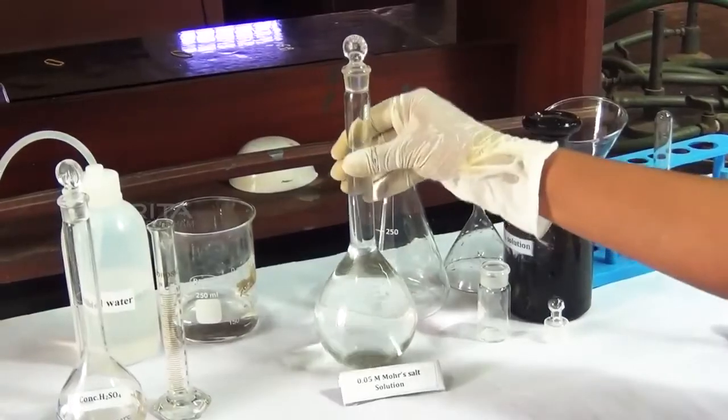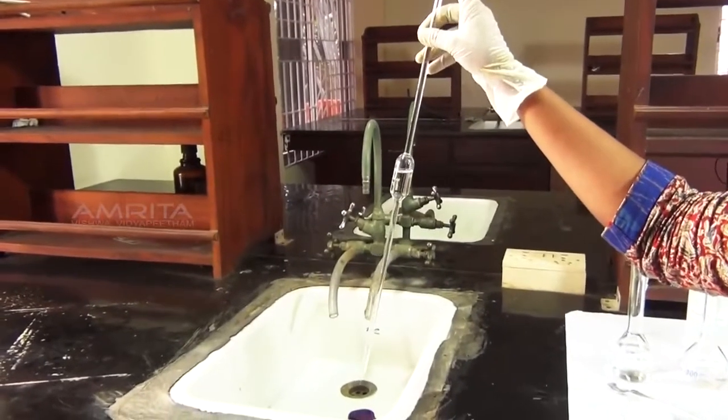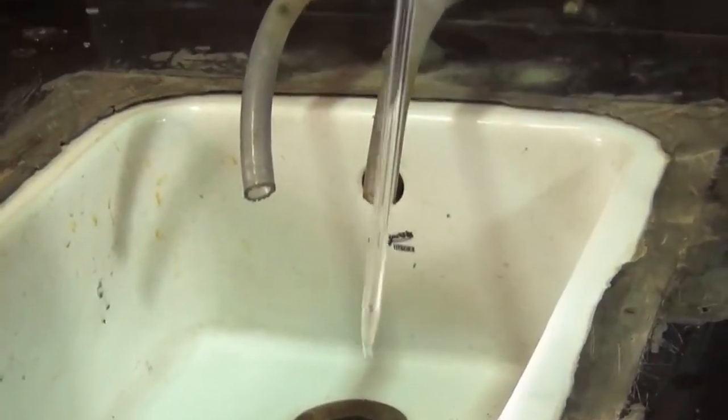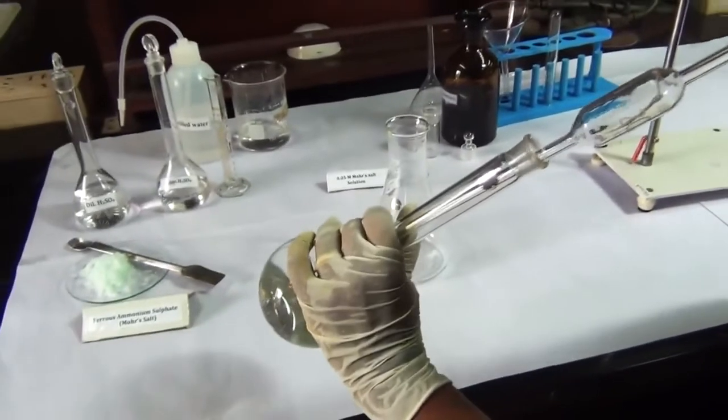Pipette out a small volume of Mohr salt solution. Rinse the pipette and drain it. Repeat this process 2 or 3 times to remove any moisture inside the pipette. Pipette out 20 ml of Mohr salt solution from the standard flask.